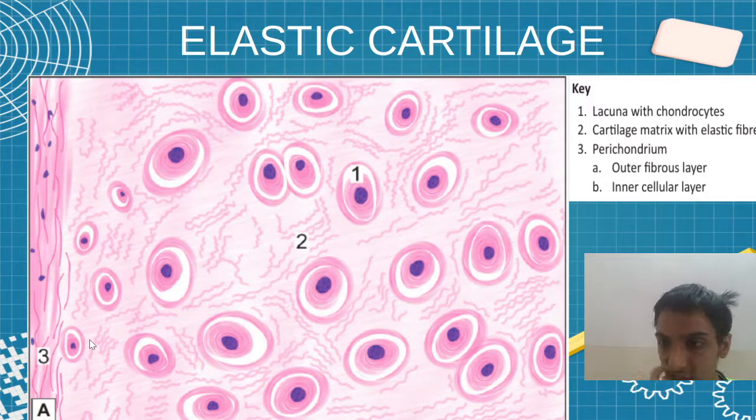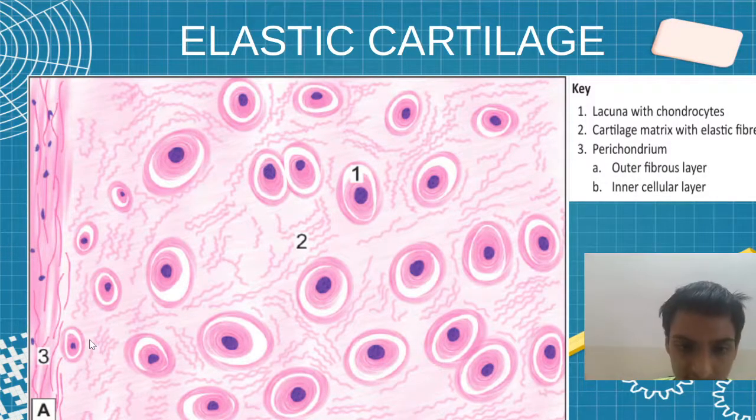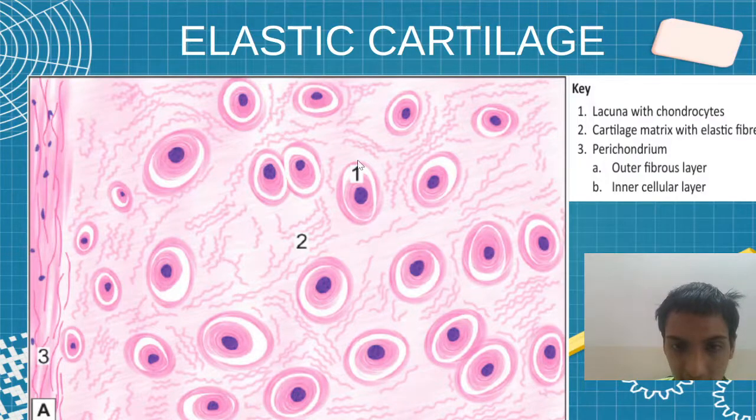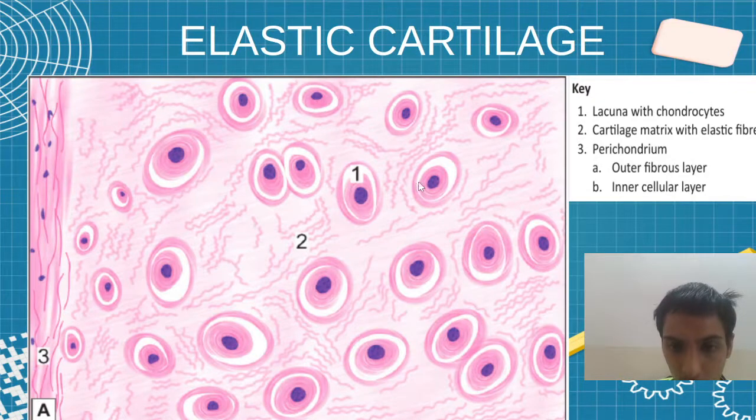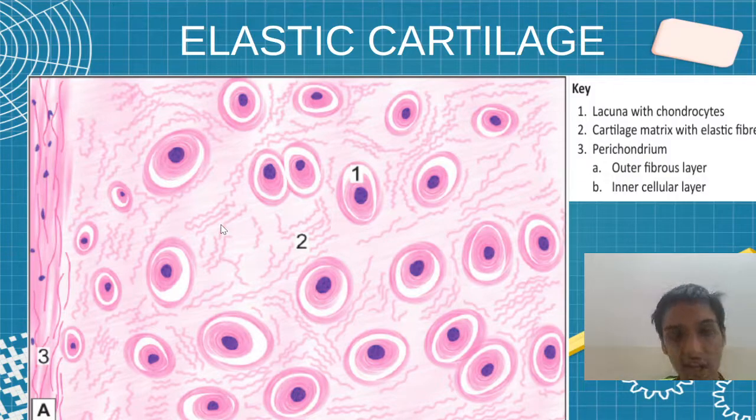Now in elastic cartilage, the important feature is the elastic fibers. The lacunae will be present with the chondrocytes. You are seeing chondrocytes in lacunae and a number of yellow elastic fibers.